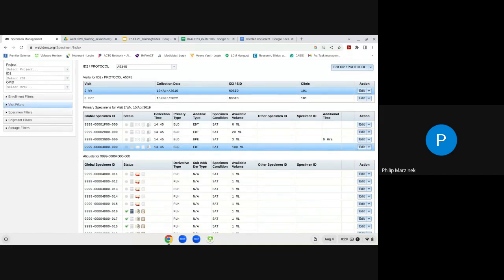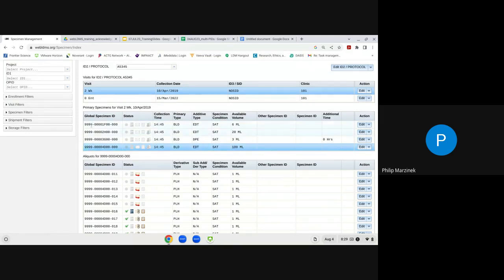The primary and aliquot grids share several features. The first is the Global Specimen ID — the LDMS unique identifier assigned to all specimens when they first enter the LDMS database. This ID travels with the specimens even if shipped to a different laboratory. Global Specimen IDs start with your LDMS lab number, followed by an alphanumeric string, ending in a three-digit code. Primary specimens end in 000; aliquot specimens range from 001 to 999, allowing up to 999 aliquots from a single primary.